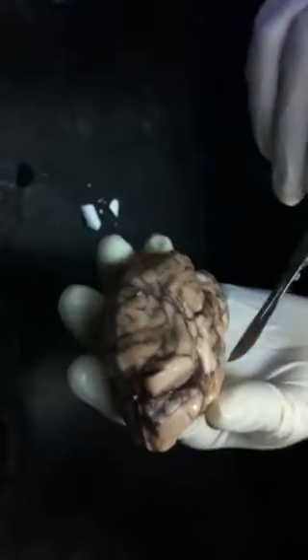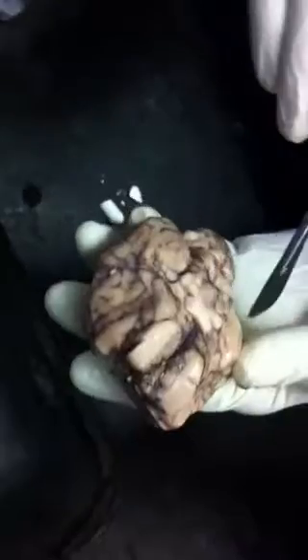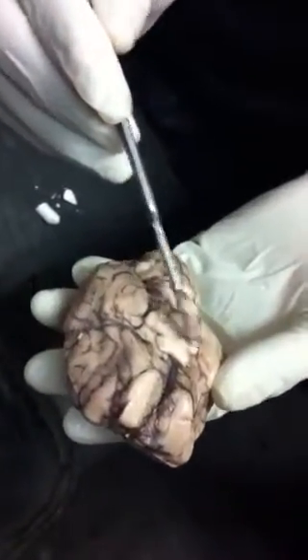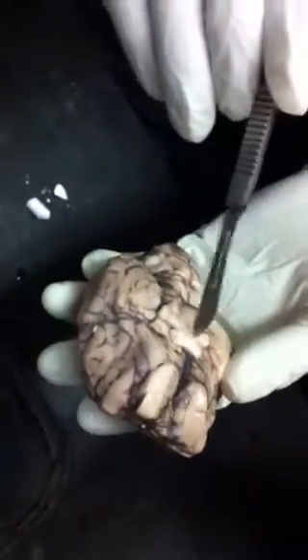Now, this is the optic chiasm. It's in the middle, in front of the optic nerves. It's where the optic nerves from the left and the right fuse at the optic chiasm. The optic tract continues from the optic chiasm. You see it? But this structure is the optic chiasm.